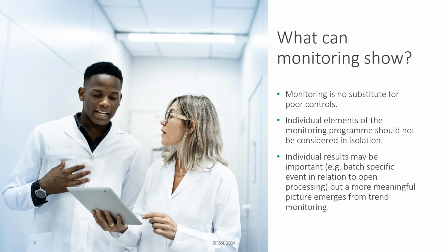We've discussed in previous webinars that there are some weaknesses with the methods, but if we put enough together and we look at the trends over time, then environmental monitoring can still be a powerful tool in terms of signaling change, provided we've got a large enough set of data and we can assess that over a meaningful period of time. We can make that even more powerful by selecting the right locations within the clean room, and then also having frequencies of monitoring that actually matter.